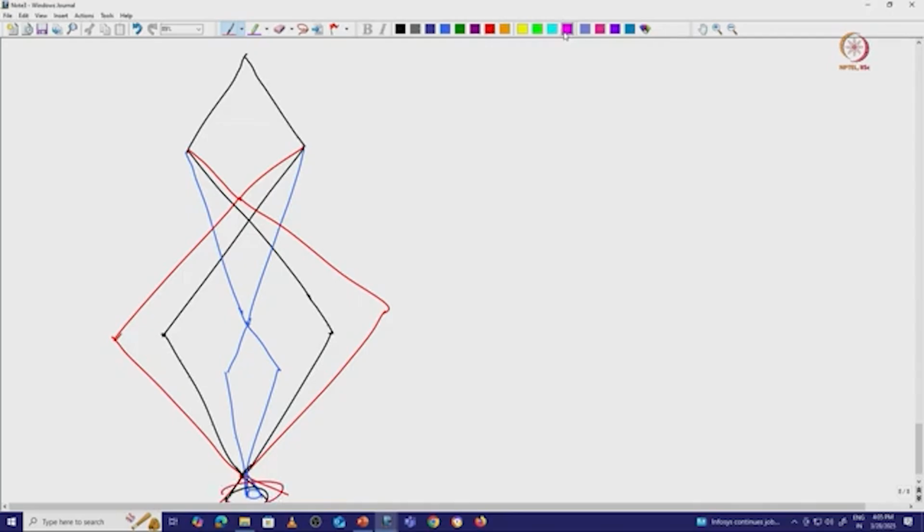Now there is another condition, where we have this pink ray. It is spread all over and goes through like this. When they go through, we get a beam diameter like this. Now in this particular case we are bringing the aperture into the picture.